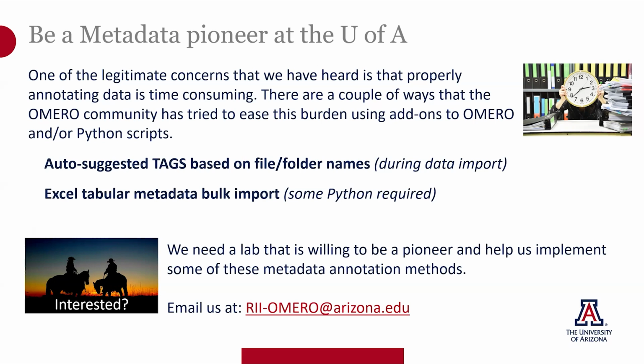There are also people working on software tools that use Excel spreadsheets to add additional REMBE metadata that would be brought into OMERO as the image data is uploaded. But right now that's still in beta and it would require working with Python. We haven't done these yet, but if there's a lab that's willing to be a pioneer and help us incorporate or implement some of these, then what we learn working with your lab can possibly help other people. And please reach out to us using this project email address, which is also in the notes below.